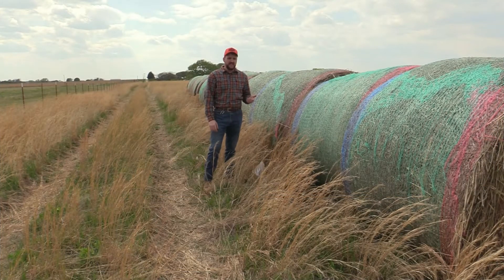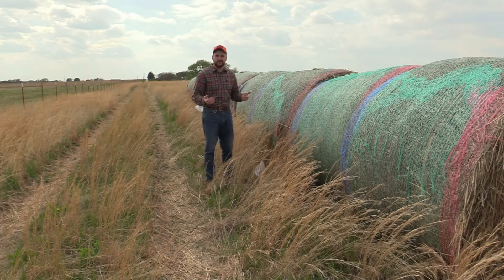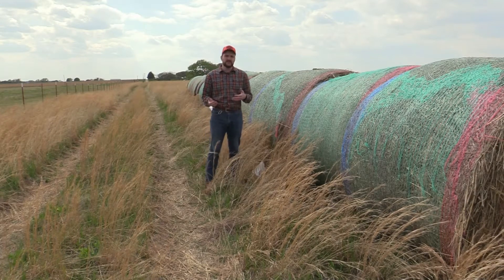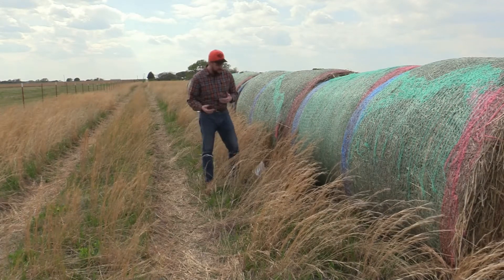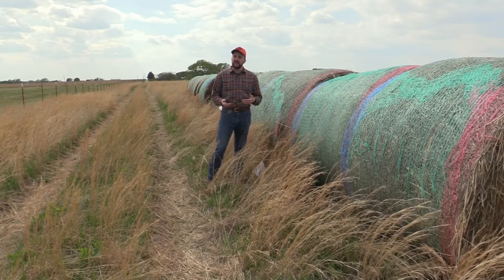I get a lot of folks calling into the county extension office wanting to know how to take a forage test. I figured it'd be easier just to show you and kind of go through all the details, but it's relatively simple. Now if you don't have a forage probe of your own, we have some at the county extension offices. You can certainly stop by and check one out.